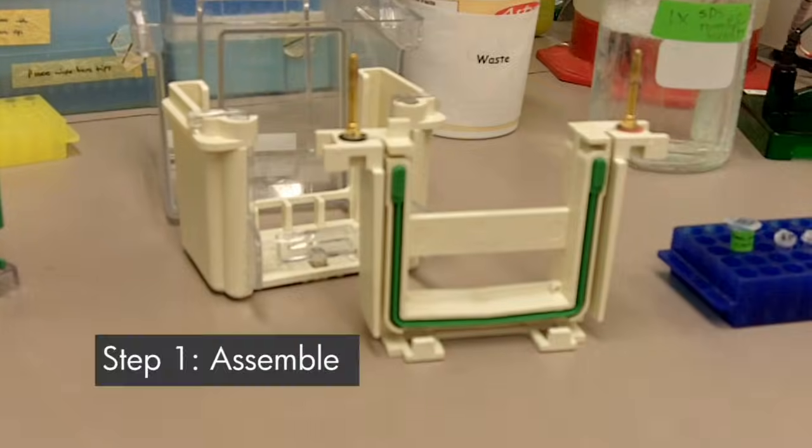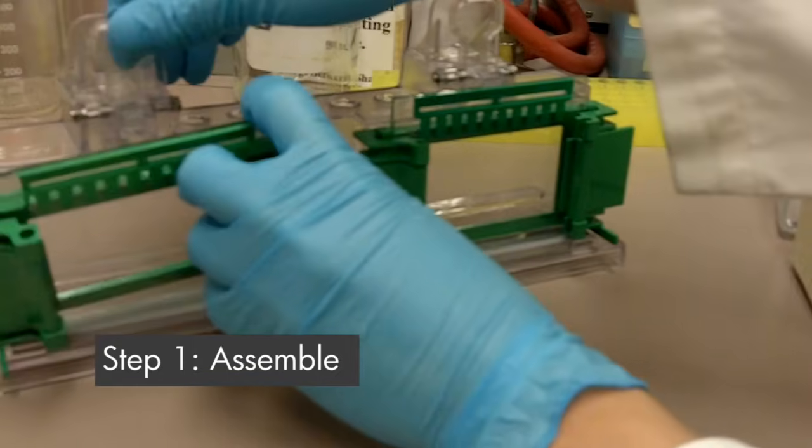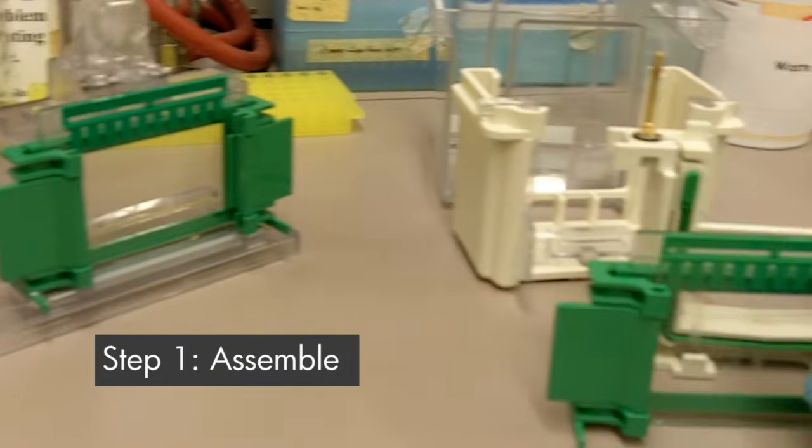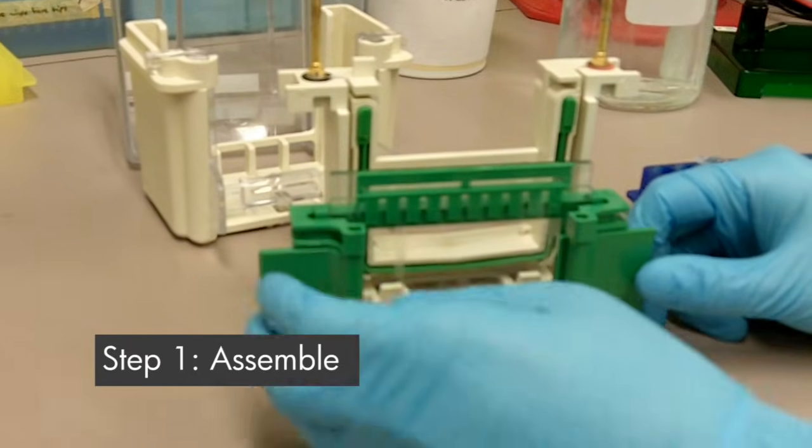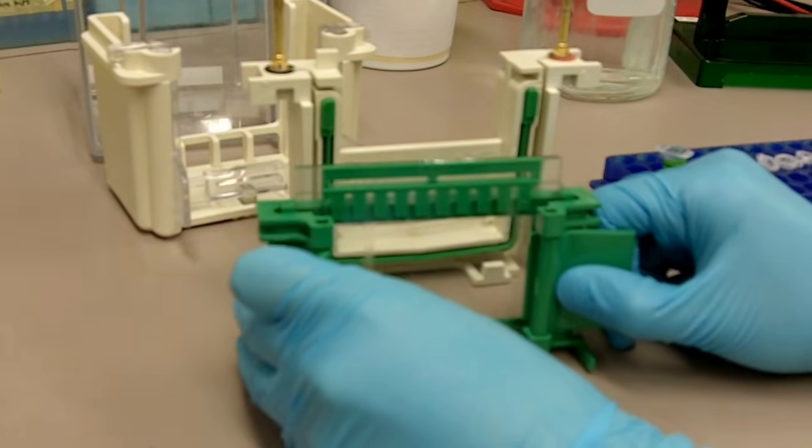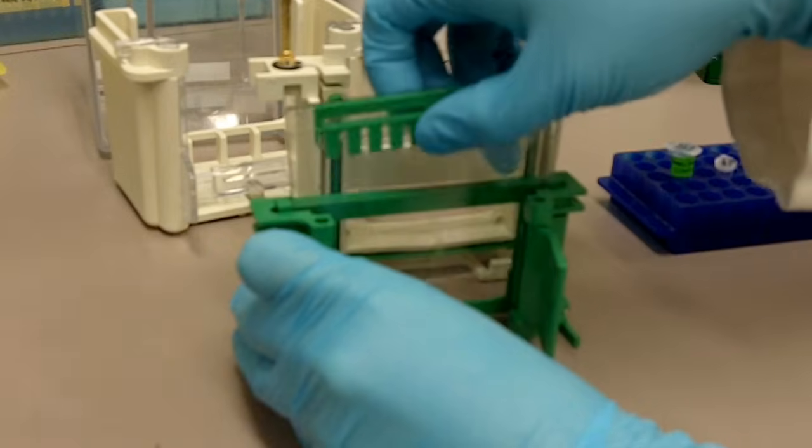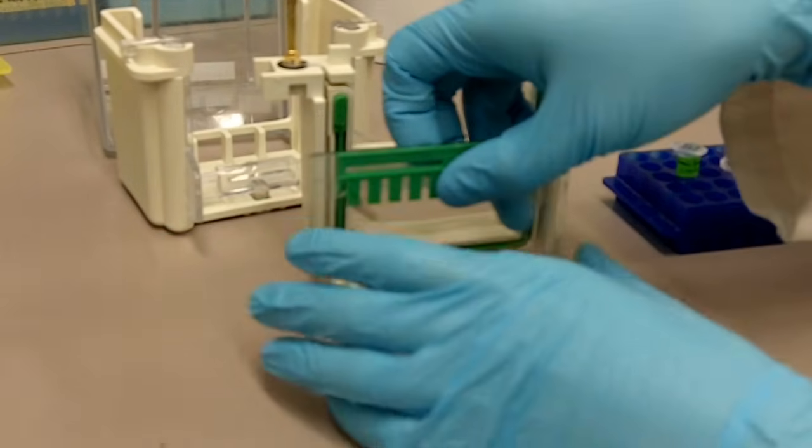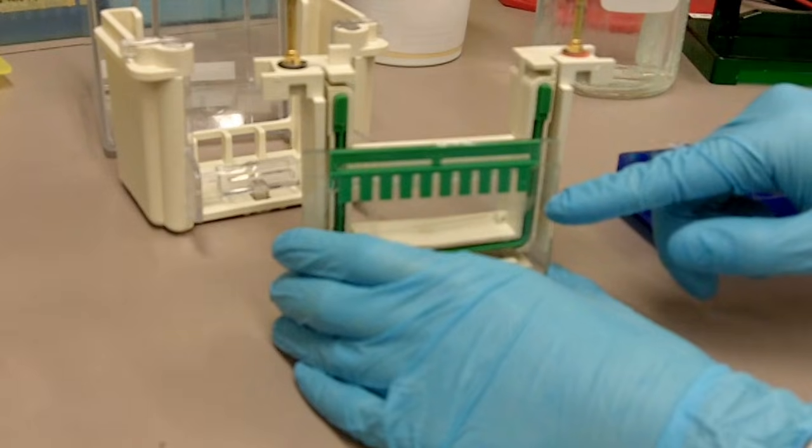To assemble the gel, first of all, we'll take the plate from the gel casting apparatus. We'll take out the plate like that, and remember there's a tall plate and a short plate.